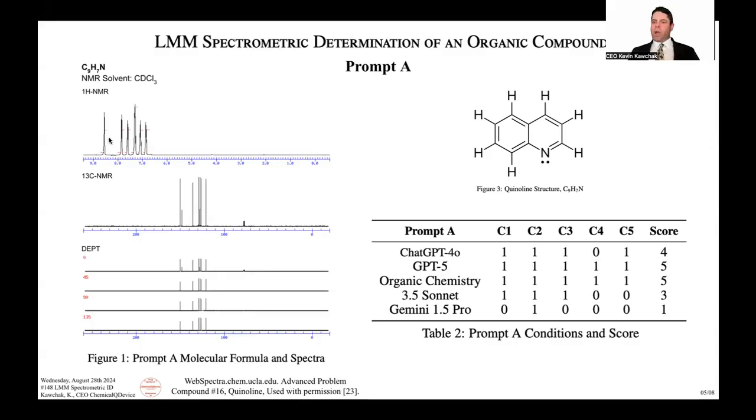If we go left to right, or downfield to upfield, we see this one at about 8.75 that integrates to 1. We see another one integrating to 1, and then another at 1, another at 2, then another at 1, and another at 1. So if we add these up, 1, 2, 3, 4, 5, 6, 7. That's where the 7 protons come from.